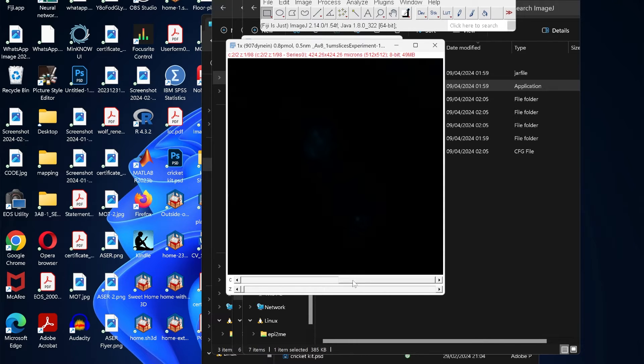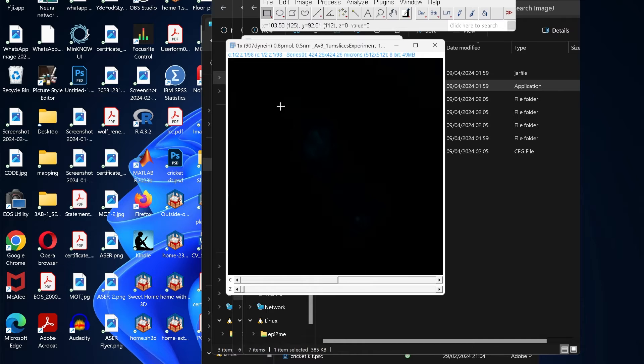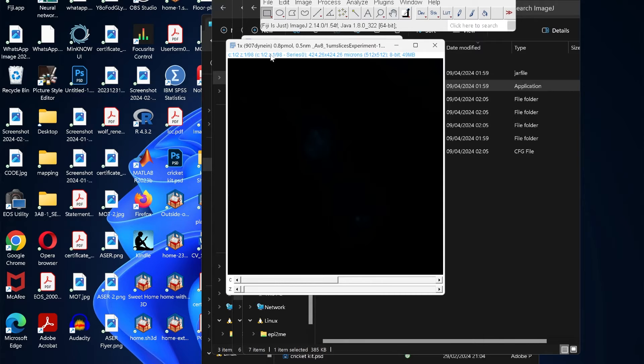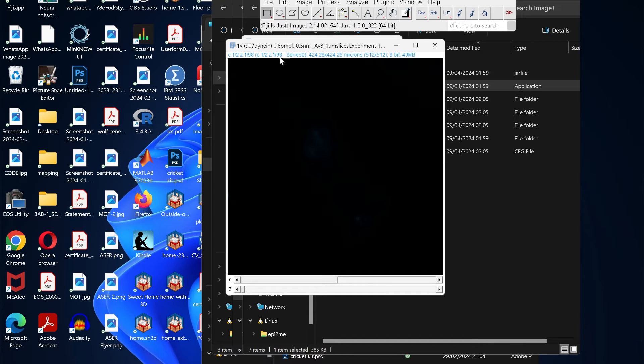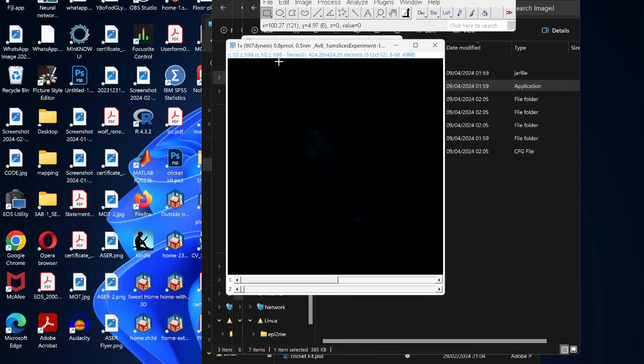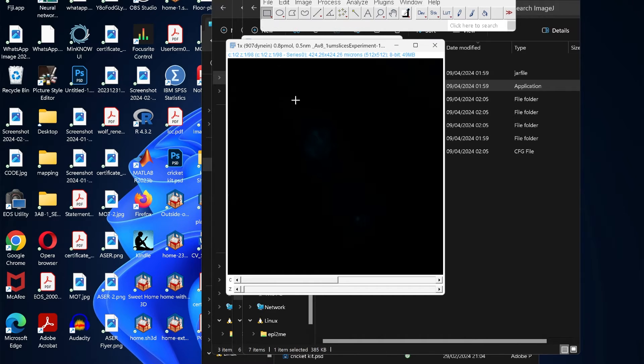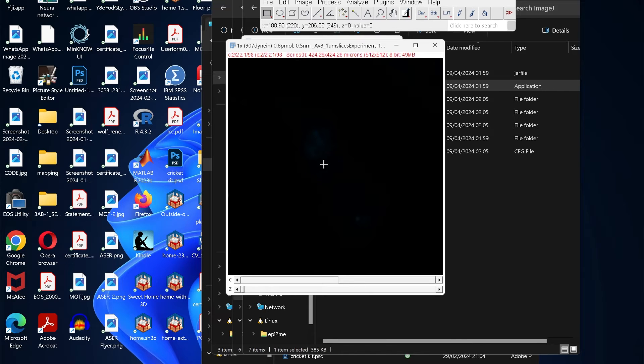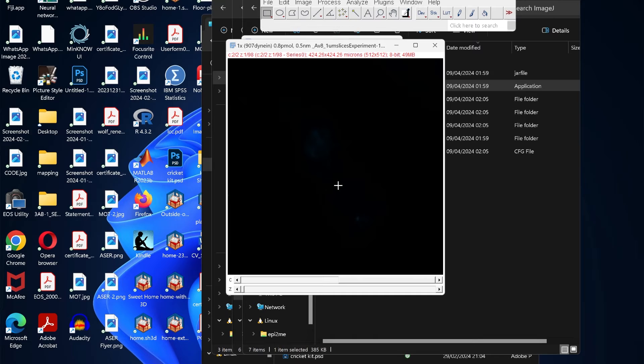We can see here two channels—this is the first channel, this is the second channel. As you move it, you see on the top we can see it says C1 of 2 or C2 of 2. It also shows the detail about the z-stack, so one out of 98—there were total 98 z-stacks and we are looking at the first one.